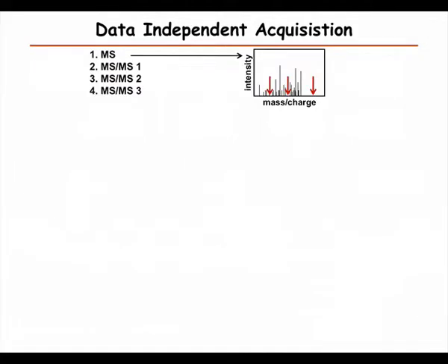So then you can collect data in several different ways. And I'm just going to go through two general ways. One is called data independent, where usually you decide in advance that you're interested in a few proteins and you're going to look for a few peptides from each protein. So independent of the survey scan, and you might even decide not to take a survey scan. So the MS is what we denote the survey scan, and then the fragment scans we write as MSMS in this case.